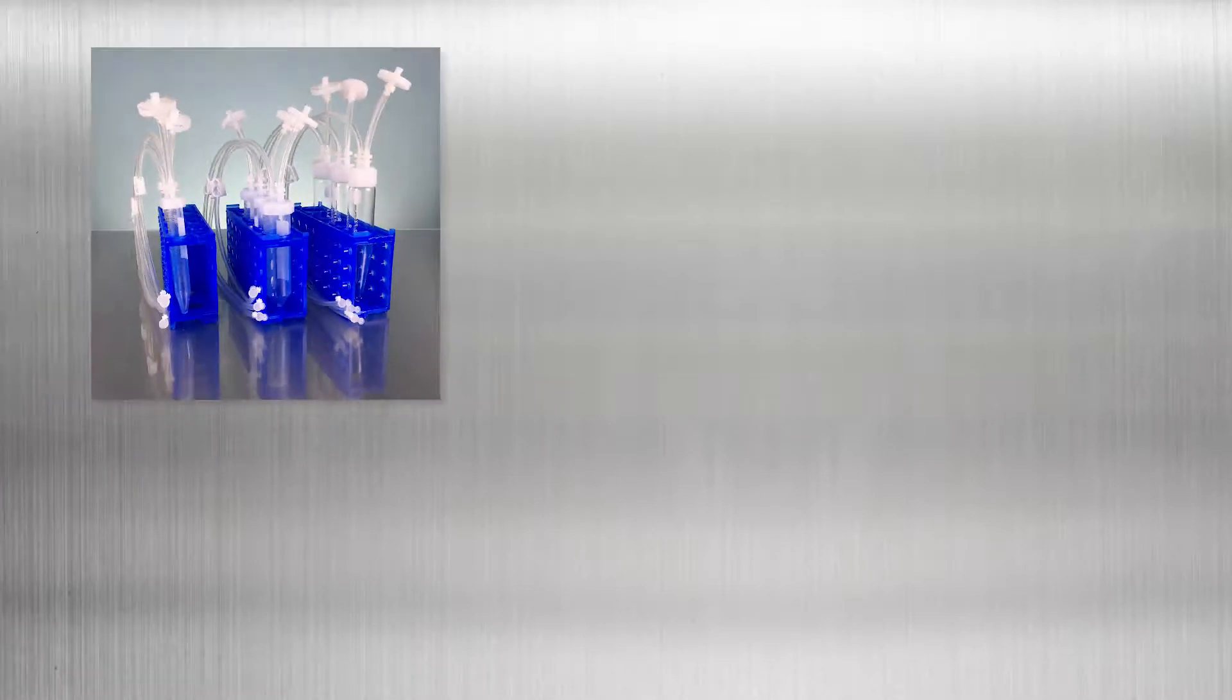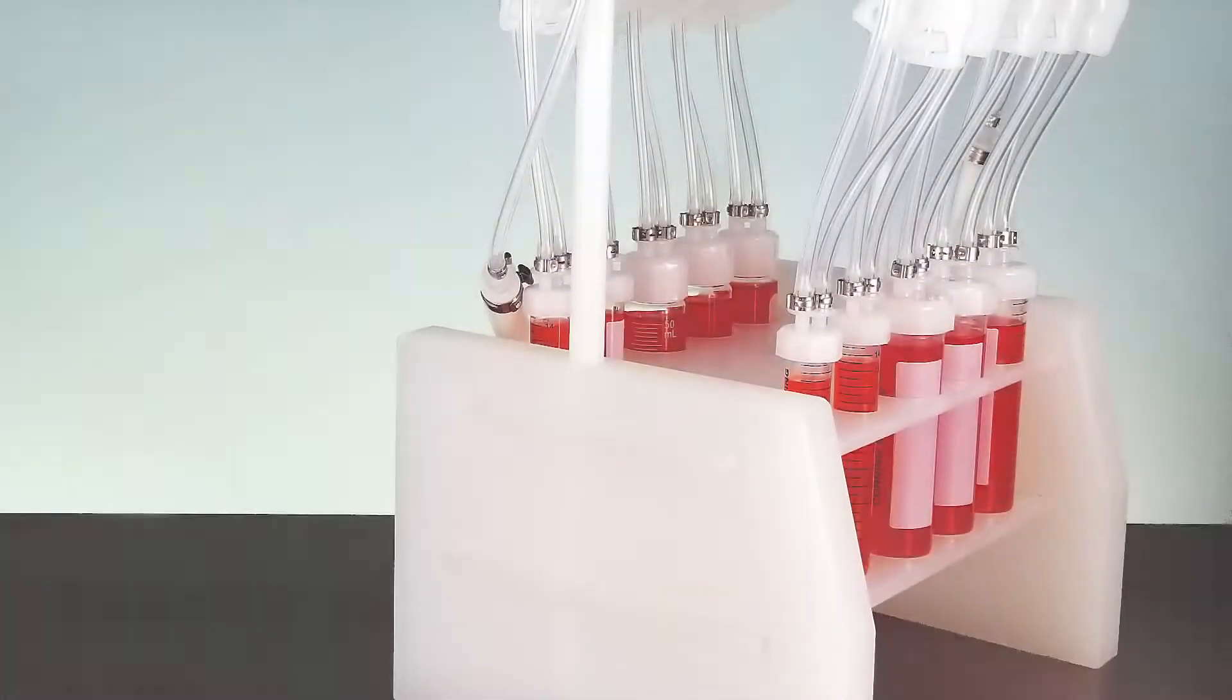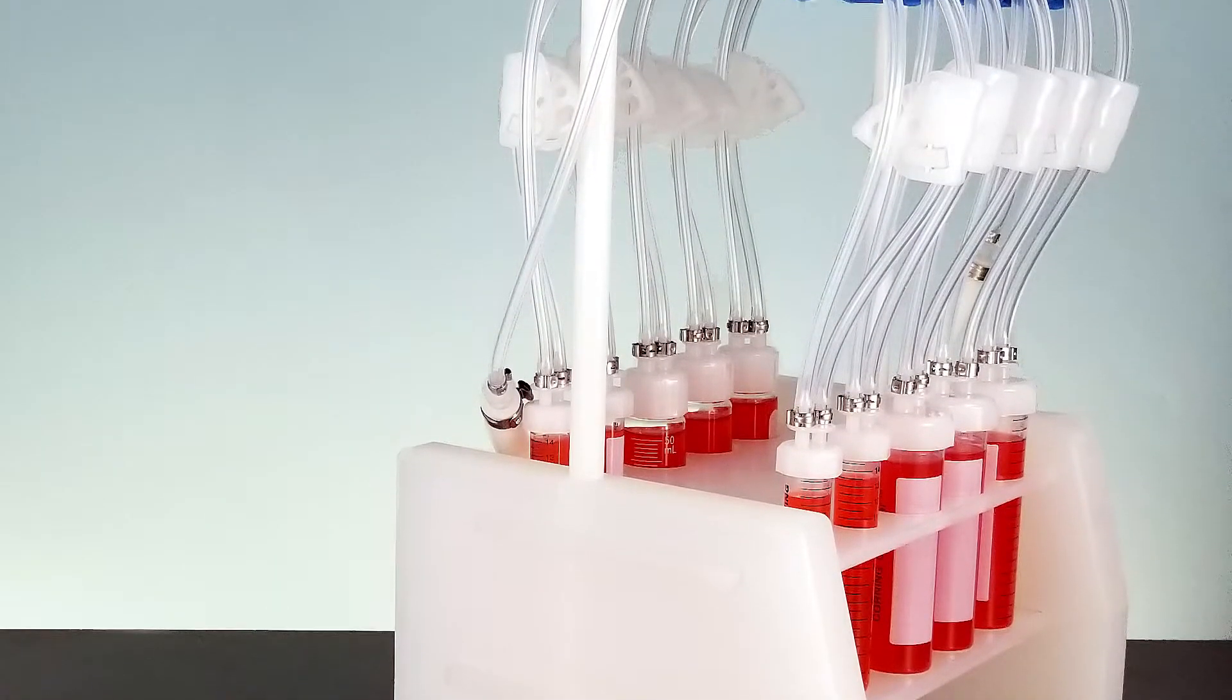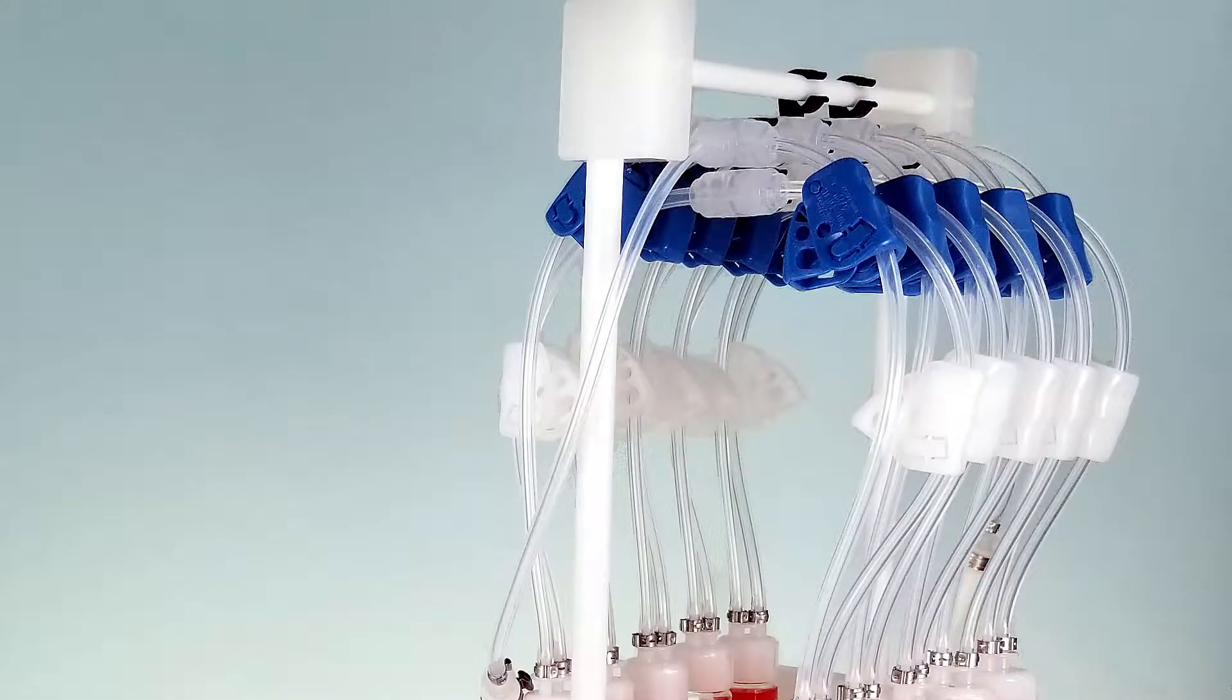Also available are multiple custom manifold options, which play a key role in the reduction in risk of cross-contamination. Manifold systems are entirely closed and can easily be welded to a larger single-use process system or bioreactor.